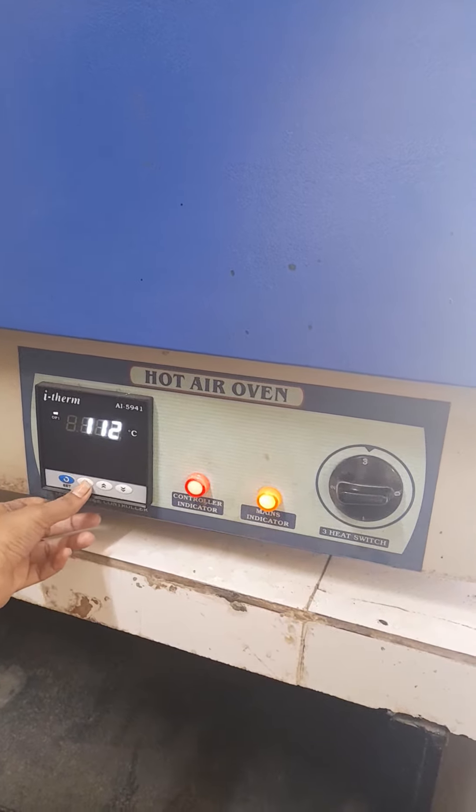You can increase or decrease the temperature according to your requirement. Here is the set button by which we can set the temperature by turning the knob. For example, we set it to 40 degrees Celsius.